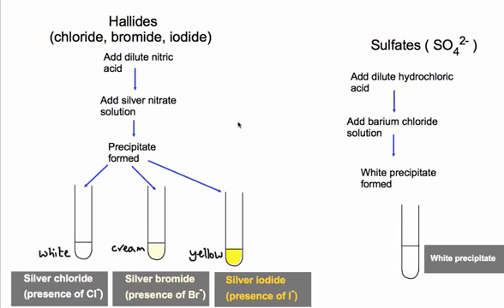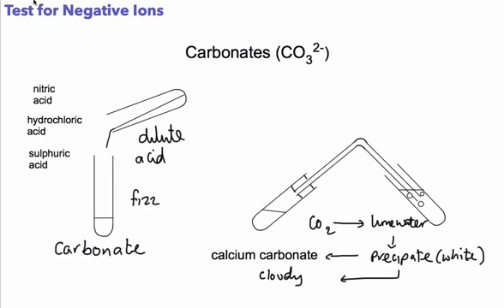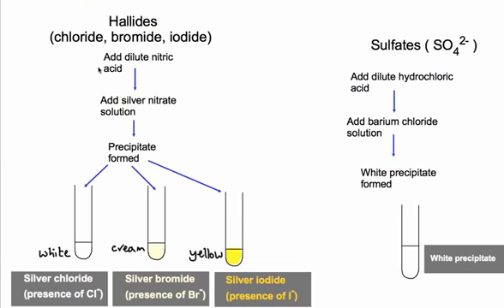Okay, so these are the tests for our negative ions. This one's quite straightforward. It's probably something that you know already. These ones, it's just a question of remembering the steps for each one, and that's basically the test for negative ions.